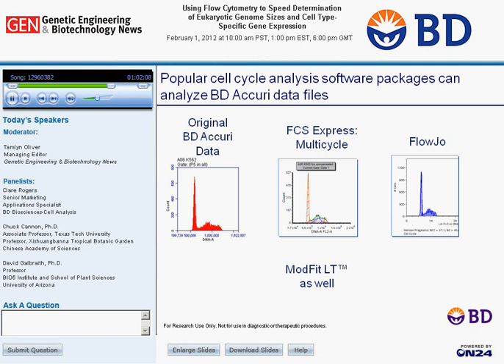So one can purchase FCS Express with multi-cycle as an add-on. And if you do that, you can run through those. They have several popular algorithms in the multi-cycle software that can be used. FCS Express is nice because it has an Accuri file importer that can be purchased along with it, which really simplifies pulling data into the analysis program. It essentially goes into your C6 file and grabs the FCS file for you, and also can grab the plots and gating strategies that you used and then recapitulate those in the FCS software. So that's a great time saver there.